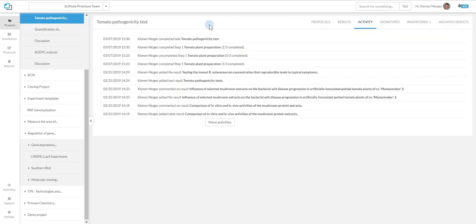In addition, by calculating the time between the first and last completion of a step, you can get the information of time spent on a specific task.